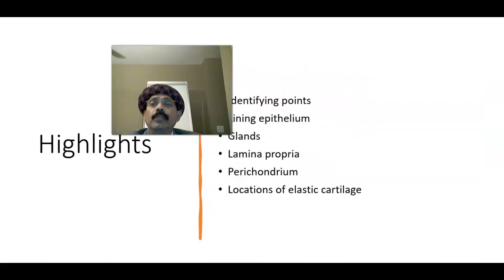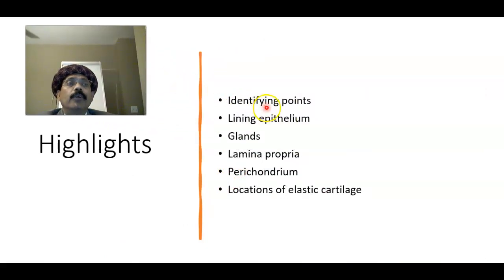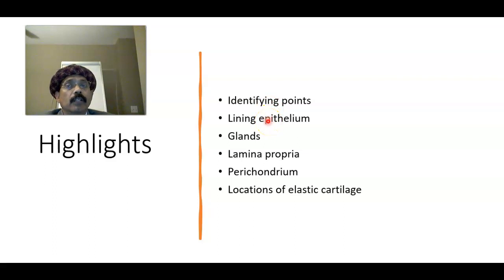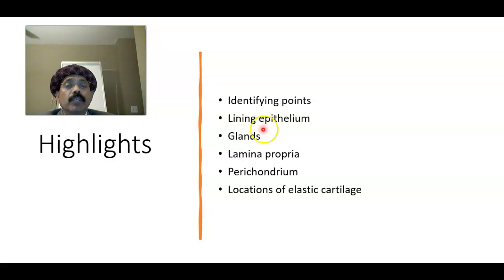So what are the highlights of this slide? The identifying point: the central core is a plate of elastic cartilage covered on both surfaces by the epithelium and lamina propria. The epithelium on the lingual surface is non-keratinized stratified squamous epithelium. The lower half of the laryngeal surface is the pseudostratified ciliated columnar epithelium. The upper half lining epithelium is stratified squamous non-keratinized epithelium.